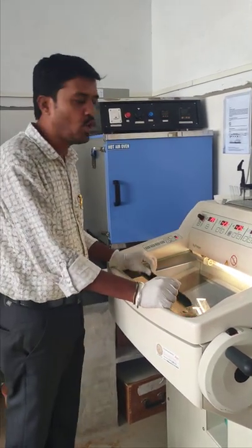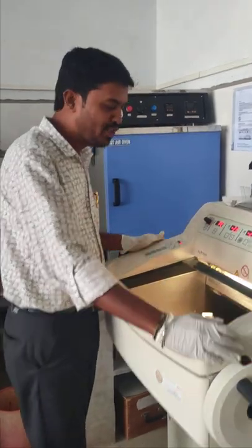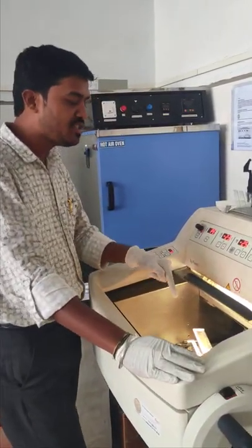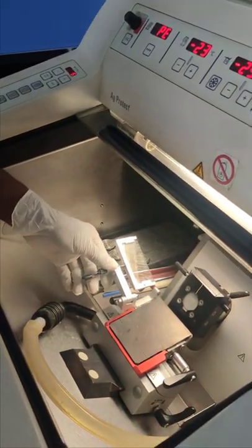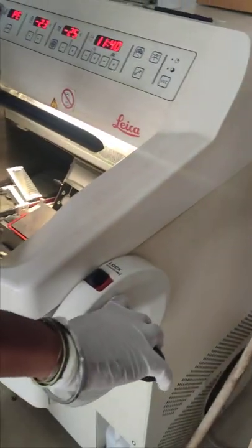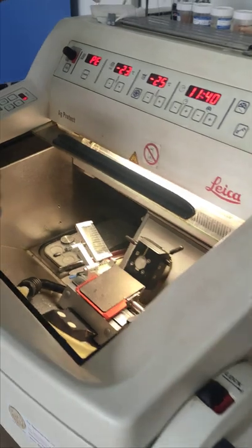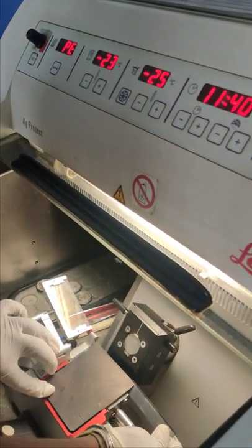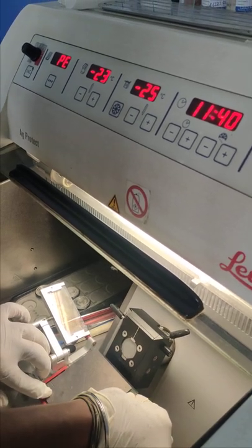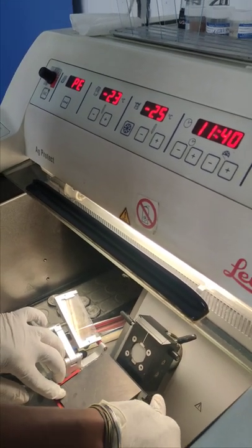We call it a cold microtome because the instrument inside is built with an advanced microtome and the rotatory handle is situated outside. Inside this machine there is a blade holder where we need to insert a disposable blade to cut the block.